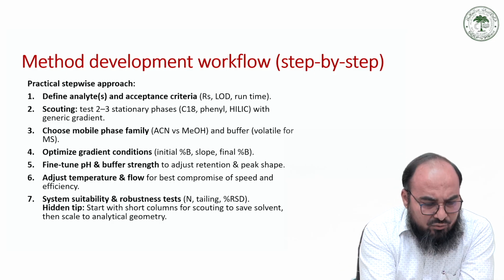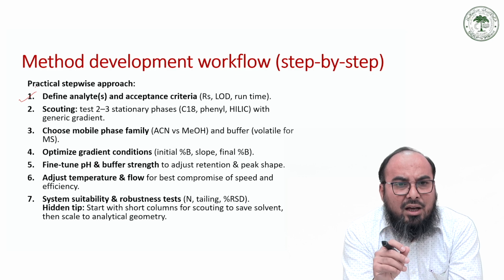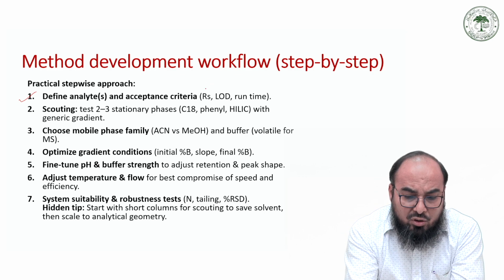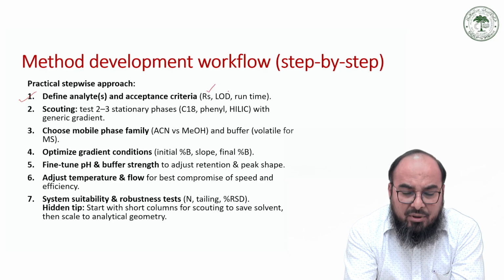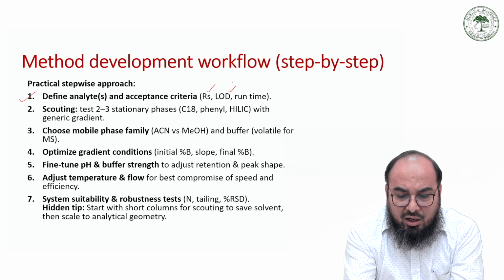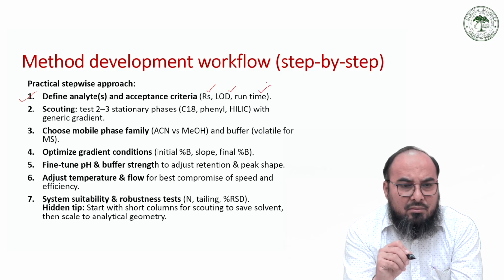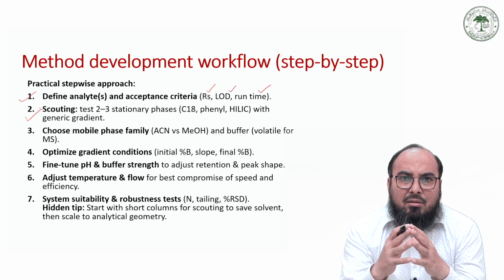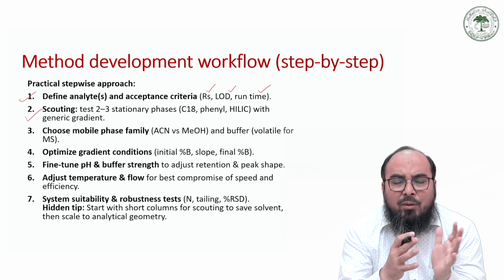So, initially what you have to do is look for the analyte which is to be separated. Now, you have to look at how much resolution you require, what the limit of detection is, and how much runtime you can afford. Similarly, you have to do scouting, you have to look for the best column with regard to the best mobile phase. So you can choose different mobile phases.